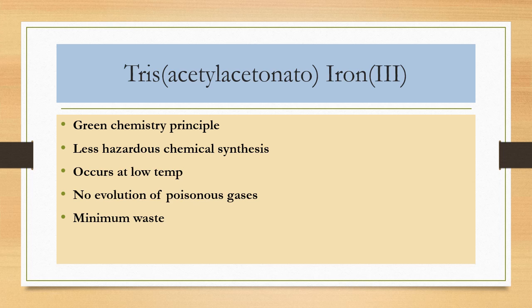The preparation of tris acetylacetonato iron(III) complex is, as it is said, based on green chemistry principles because it obeys the following rules: it is a less hazardous chemical synthesis, it requires very low temperature, there is no evolution of poisonous gases, no vigorous reaction, minimum waste and no byproducts. Hence it is based on green chemistry principles. Metal acetylacetonates are highly efficient catalysts.